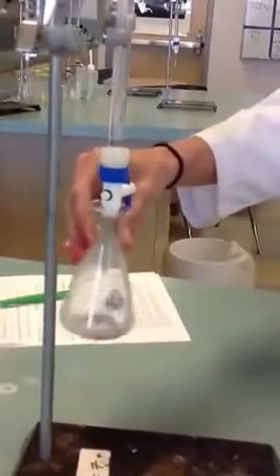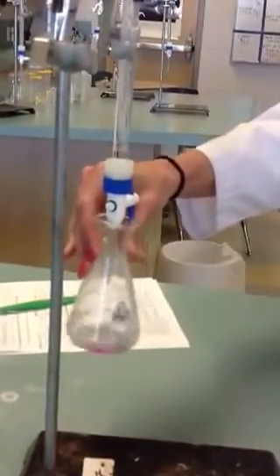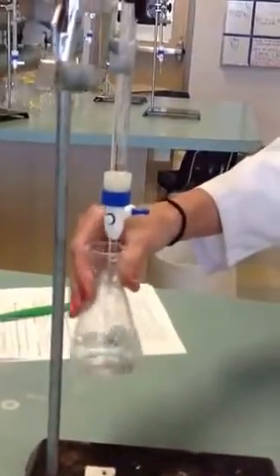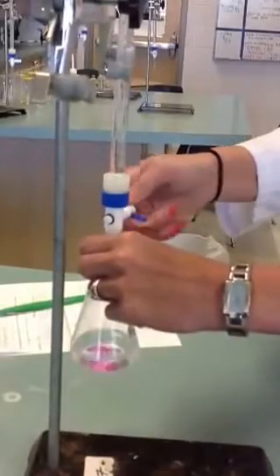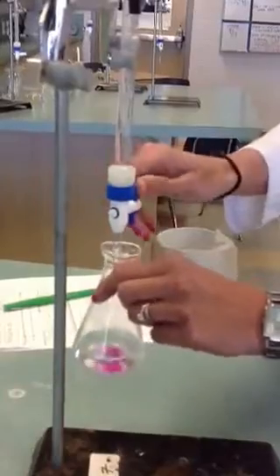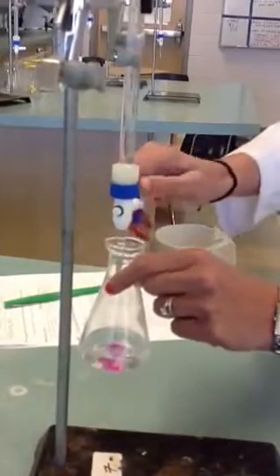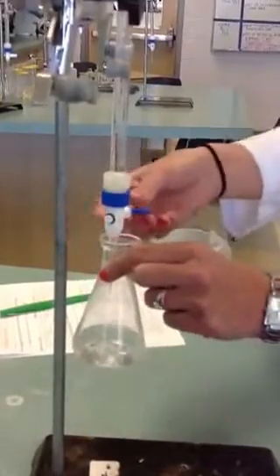I'm going to keep putting the base in and swirling. If you notice, that pink is actually starting to stick around a little bit longer, which is good. We're getting close to our equivalence point — and actually to our end point. So I'm going to do the drop and swirl. This part takes time and patience; this is not a fast part of the lab. But if you're patient and do it right, you only have to do it once.